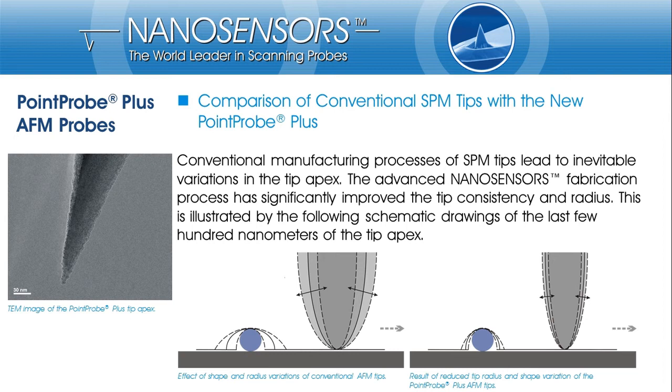The huge variation in tip shapes of conventional silicon AFM tips leads to corresponding variations in tip artifacts, as indicated in the left image. The improved consistency in imaging of PointProPlus AFM probes is illustrated in the right image. The smaller tip diameter reduces tip convolution artifacts, and tip shape consistency reduces variations in measured lateral dimensions.